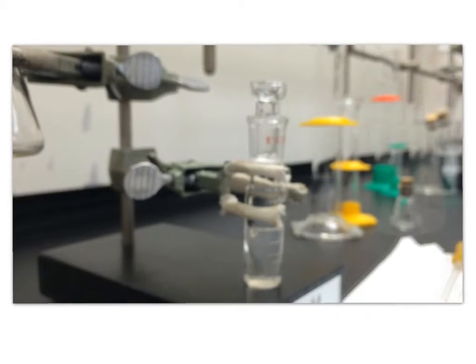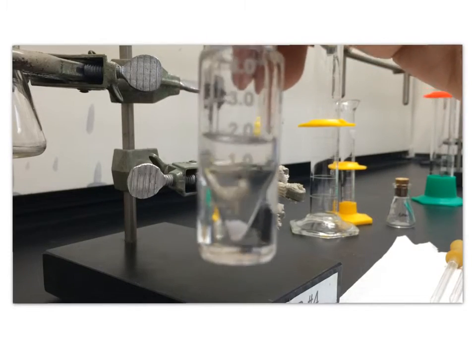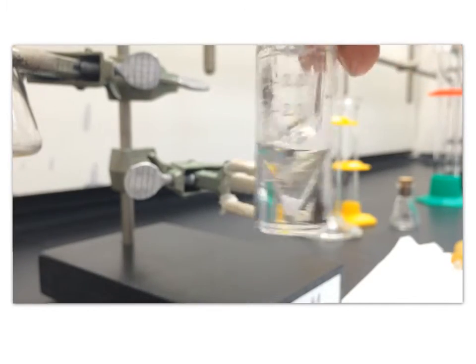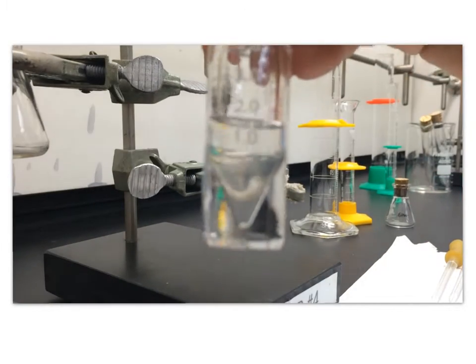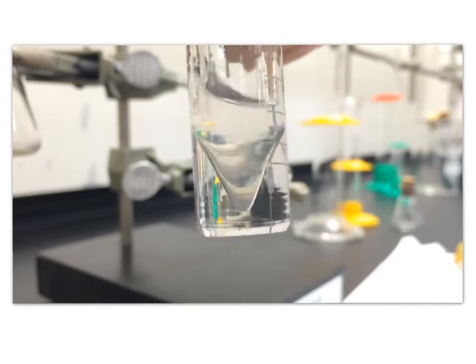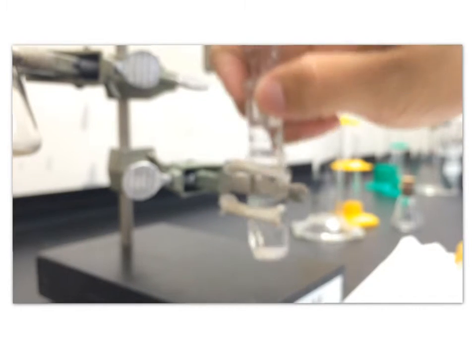In this laboratory, a small amount of solid compound that contained a possible combination of an acid, base, or neutral substance was obtained and had to be initially dissolved in diethyl ether, and then separated and extracted using NaOH and HCl aqueous solutions. Once extracted, the samples had to be tested for their respective melting points to determine what the substance was.